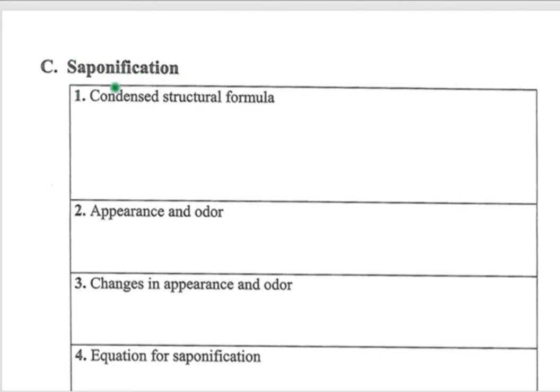What happens in a saponification reaction? Well, you take an ester. I'm using a little prime here on this R group just to represent that this is what's associated with the alcohol part of the ester. Now, saponification is also known as base hydrolysis. And so what you see here is some strong base, usually sodium hydroxide or potassium hydroxide, and then you would heat it up.